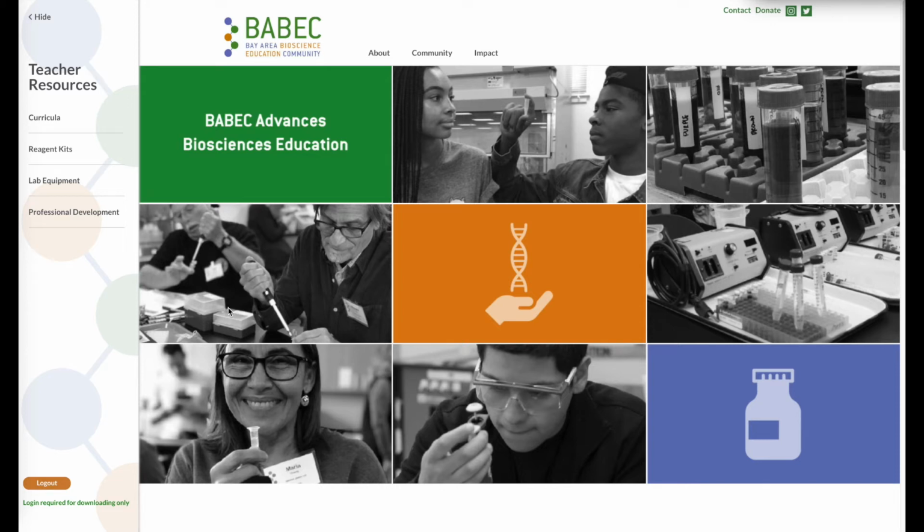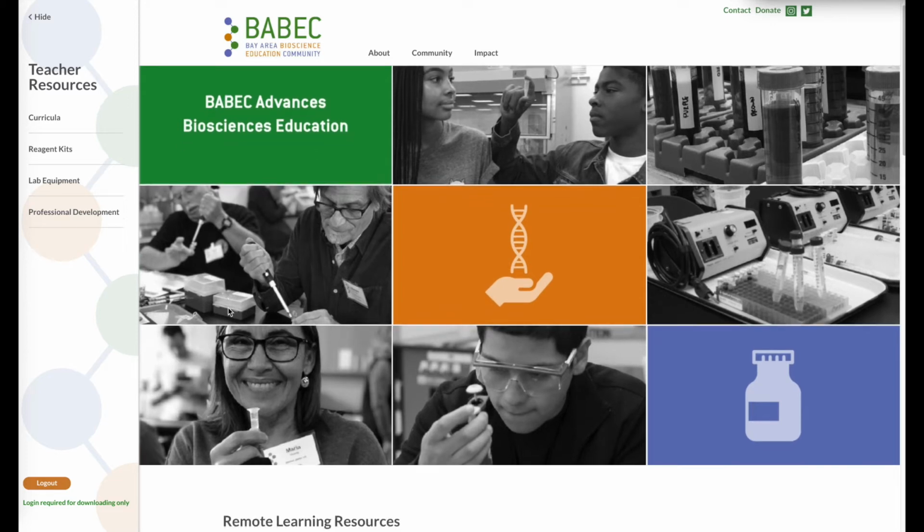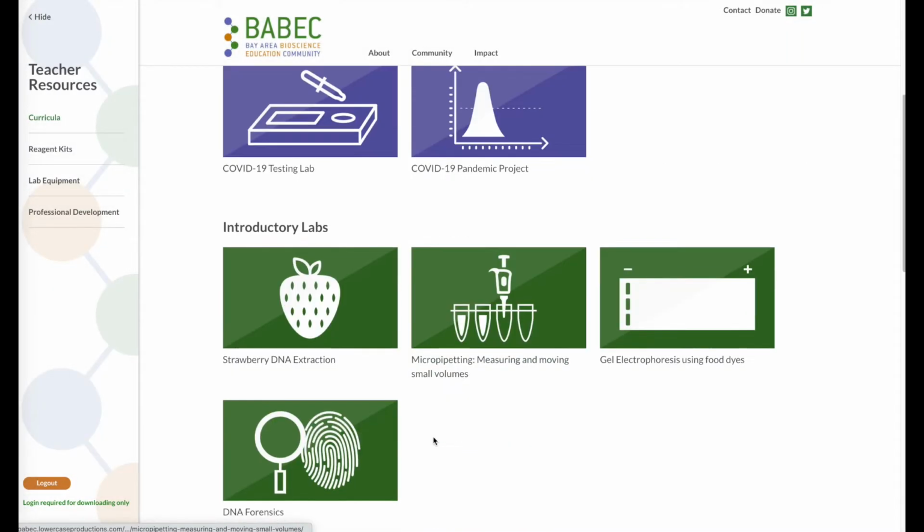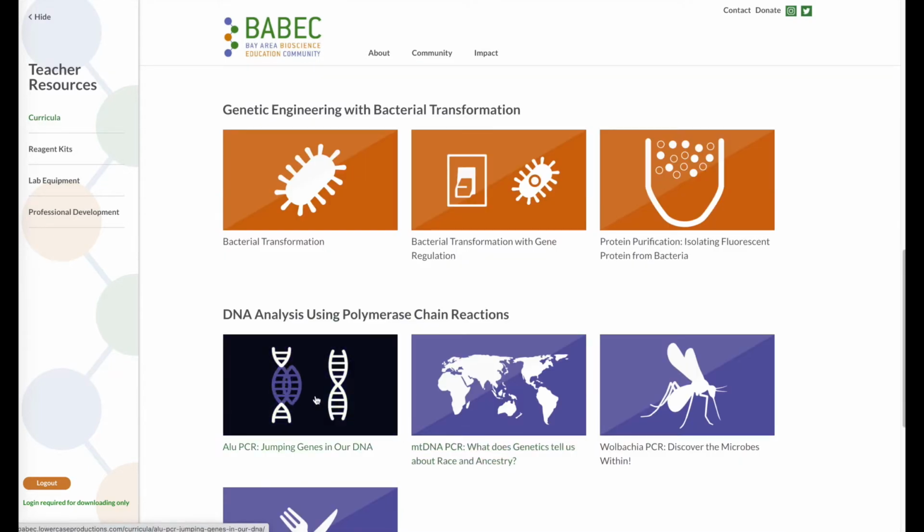We've created a quick tour of BABEC's online resources to get you up and going as quickly as possible. If you are visiting our site for the first time, you will be prompted to log in quickly before accessing our materials. We'll use our ALU PCR curricula to show how each of our lab experiences are organized for teachers.